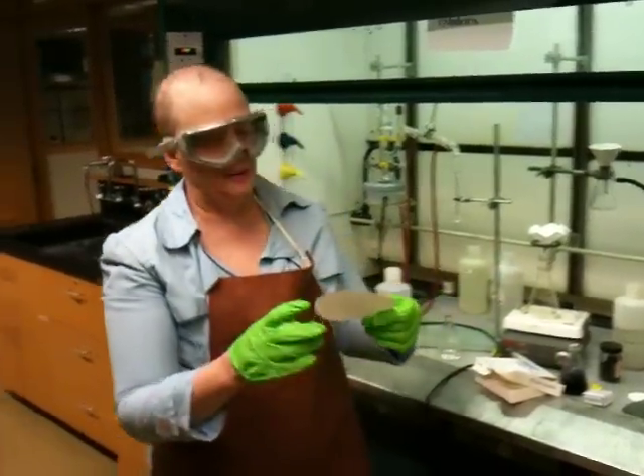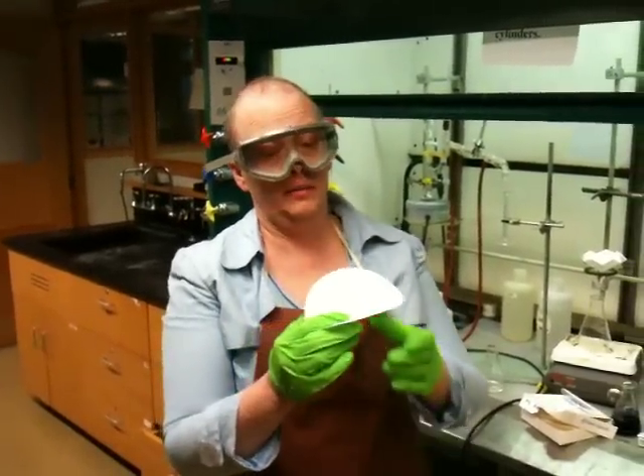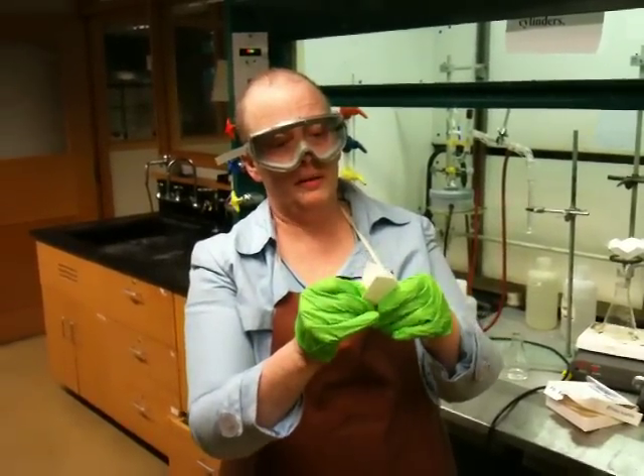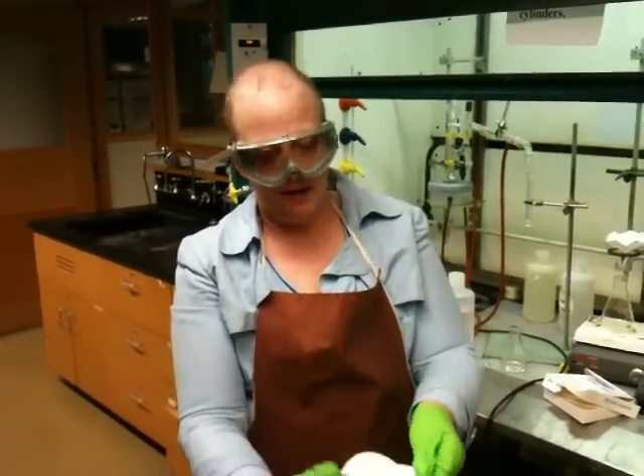People who like to do origami are very good at this. We will actually do this in class and have you practice a little bit. What you want to do is fold the filter paper in halves, like this. Then fold the filter paper in quarters, like this. Then you open it up.